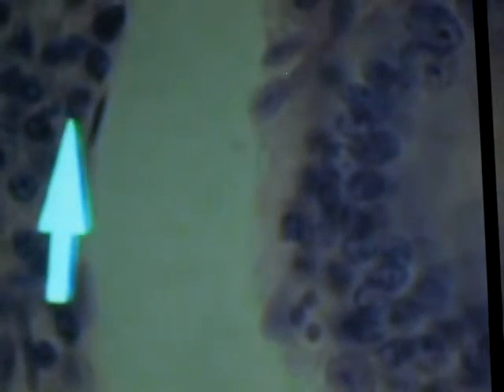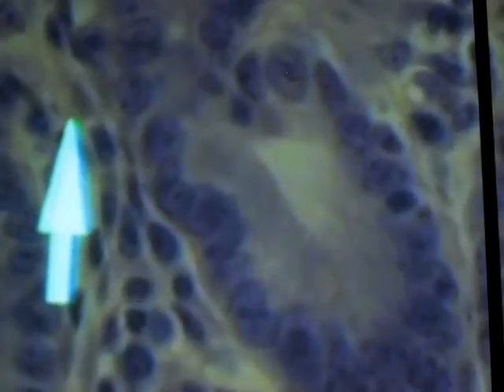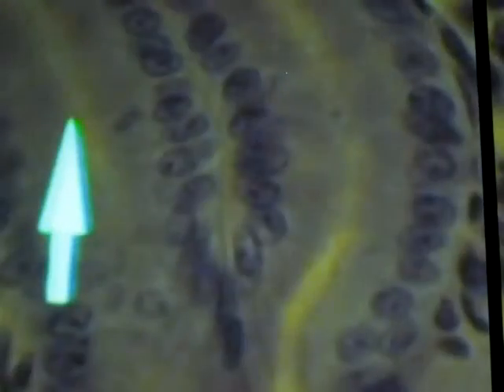So we know it's not an artery. We're not seeing any blood cells, so it's probably not a vein. This would be a lymphatic vessel. Notice how the nuclei are spaced out. So this would be a central lacteal that's present in the villus. This is a pretty big one here. That's the beginning of your lymphatic system within the small intestine. And here's another one here.